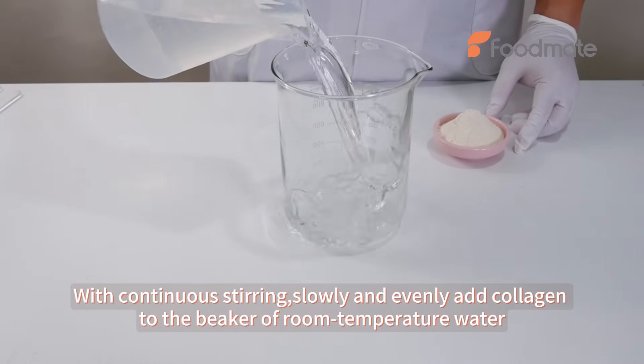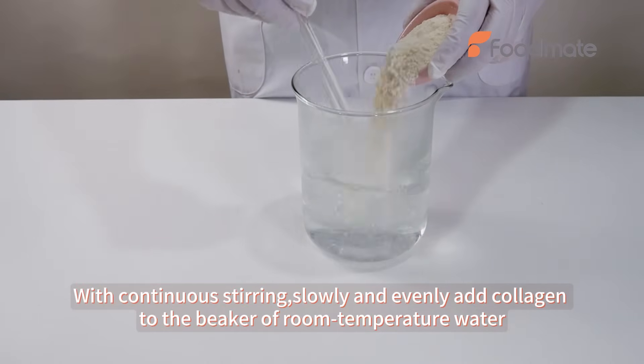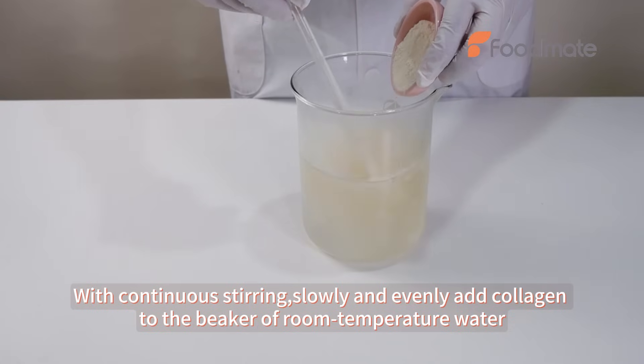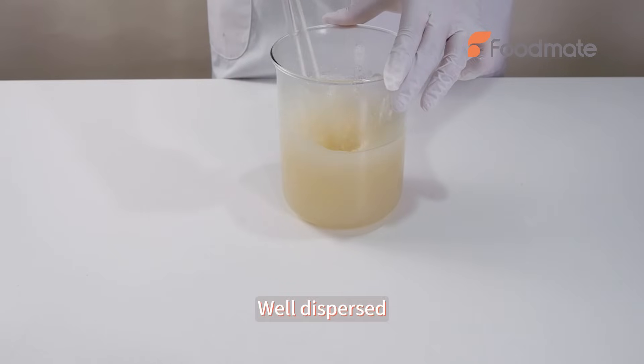With continuous stirring, slowly and evenly add collagen to the beaker of room temperature water. Well dispersed.